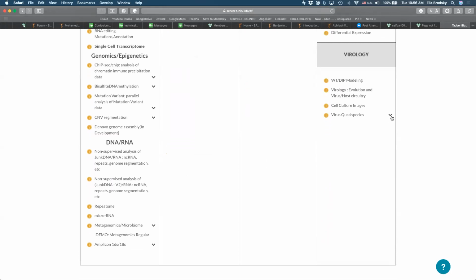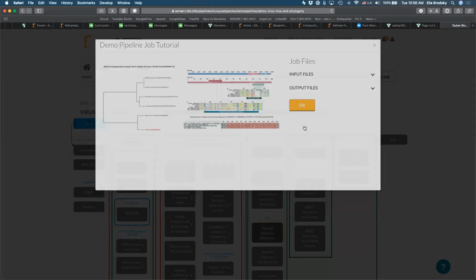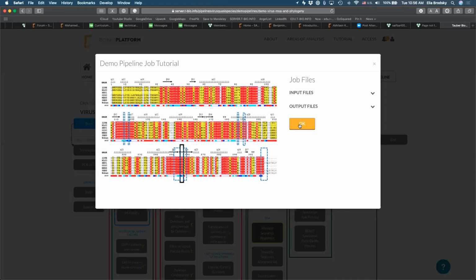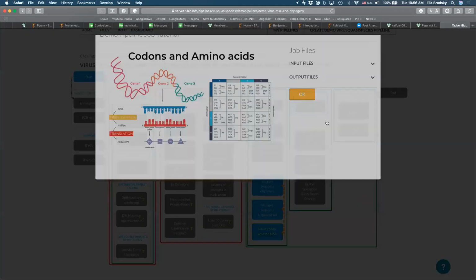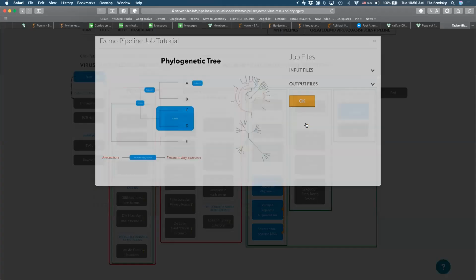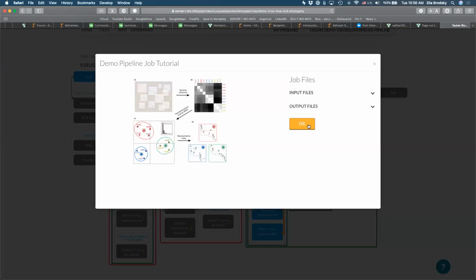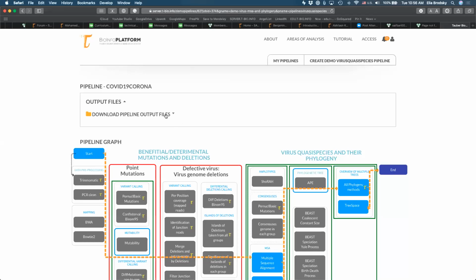If you click on a demo, you'll see some examples that we will be going through in this program, explaining step by step what each of these steps means and how it relates to the study of SARS-CoV-2 genomic data. So you can start playing around with some of these, and we will also be showing you specific examples of sequences and data files that you can take and use with some of these tools.